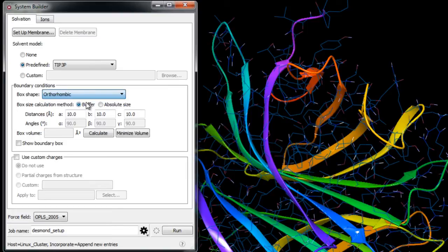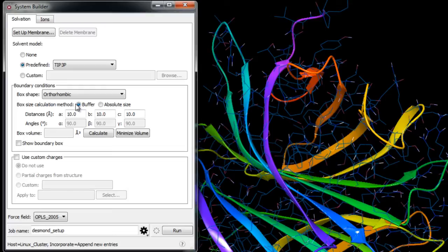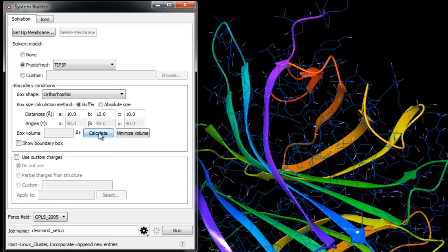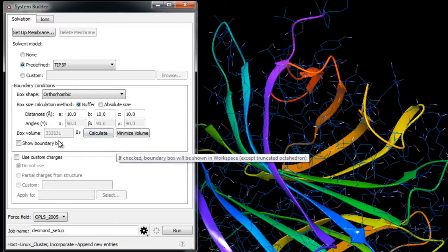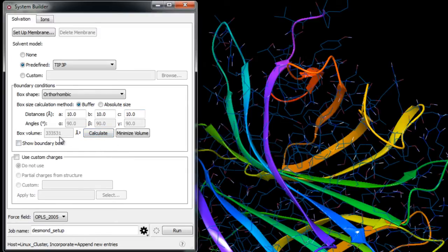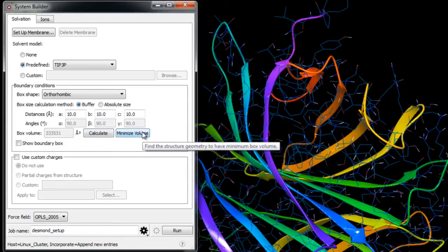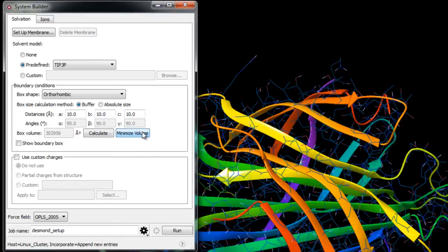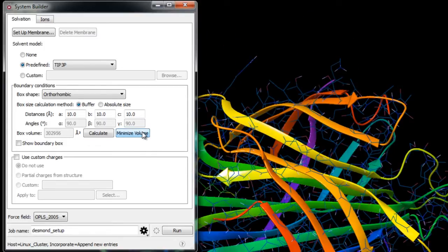We'll ensure that buffer is selected for the box size calculation method and that all three distances are set to 10 angstroms. We can calculate the initial box volume here and note the volume which is around 333,000 cubic angstroms. But by clicking Minimize, the protein is reorientated to minimize the volume of the box, so now the volume is around 303,000 cubic angstroms.